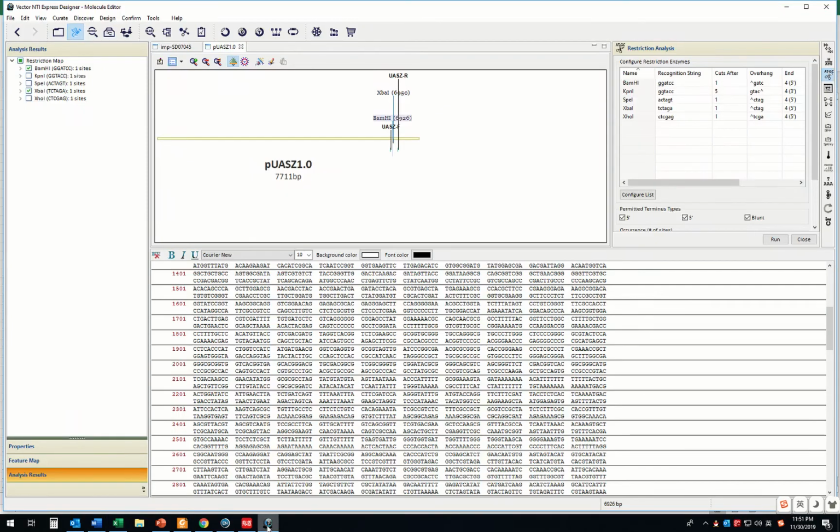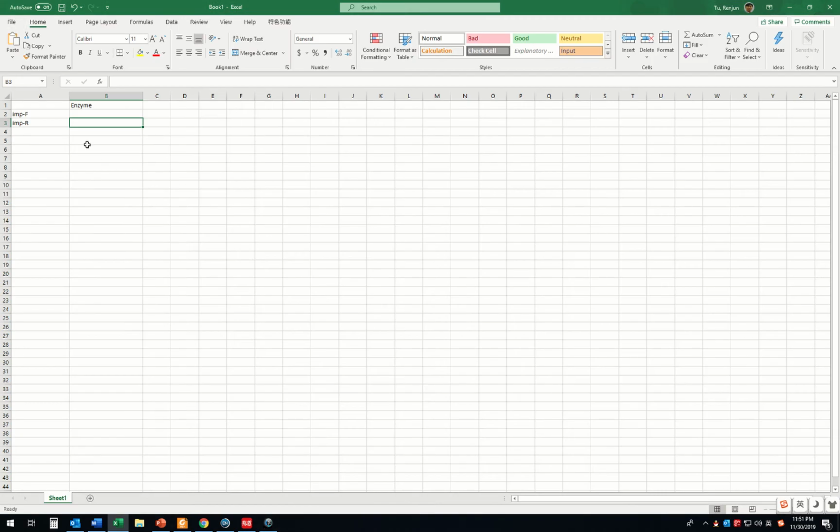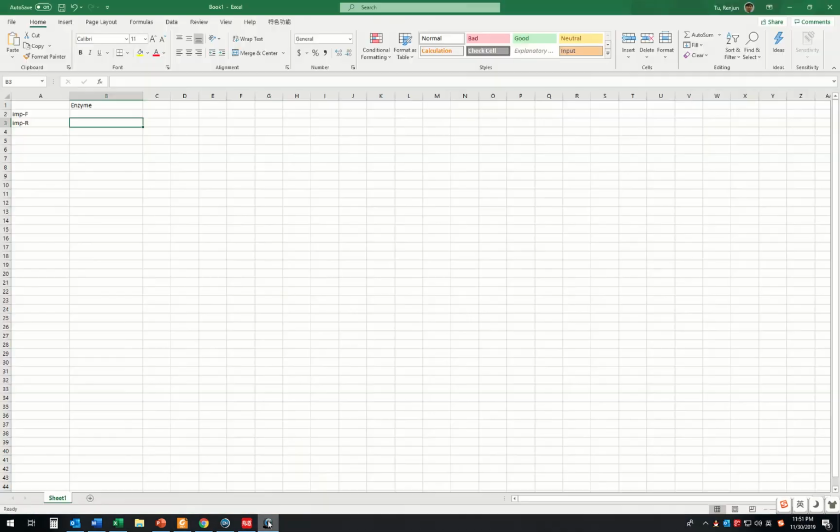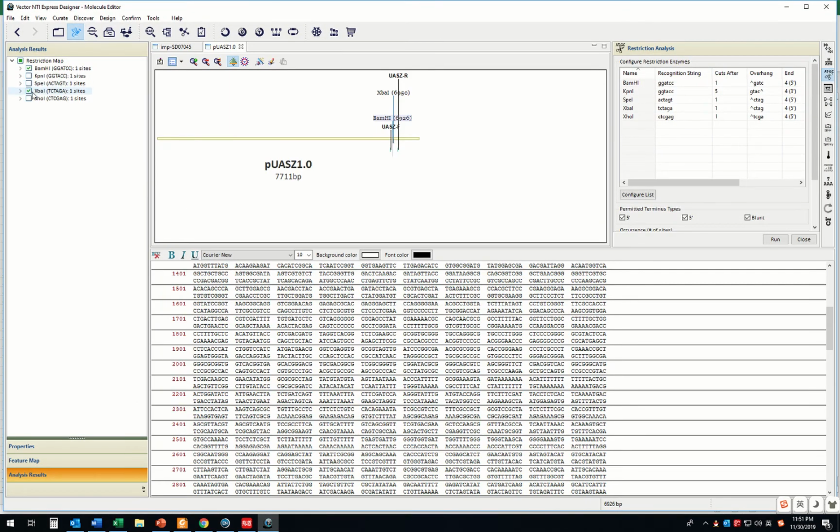For example, we can choose two of them. The first is BamHI, which is GGATCC. Here XbaI is TCTAGA.